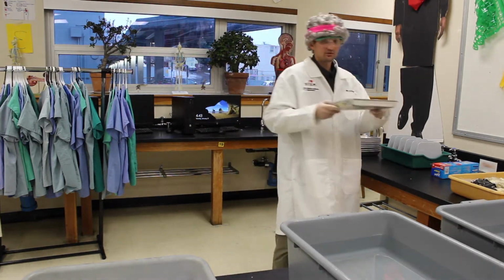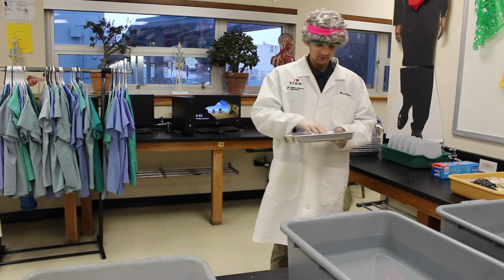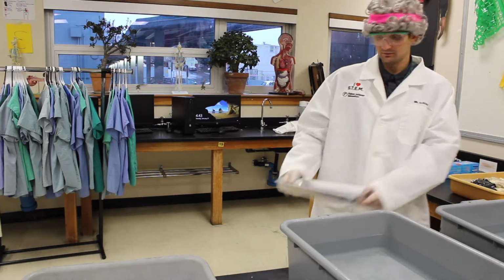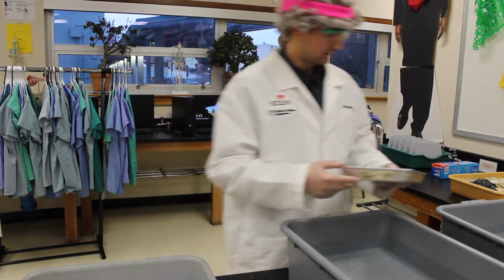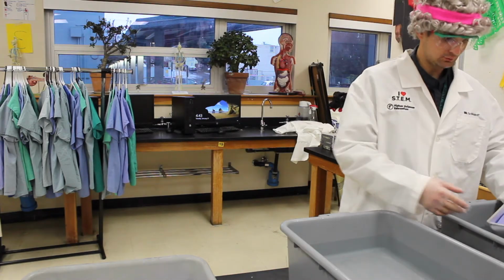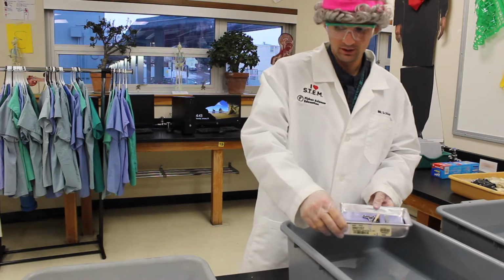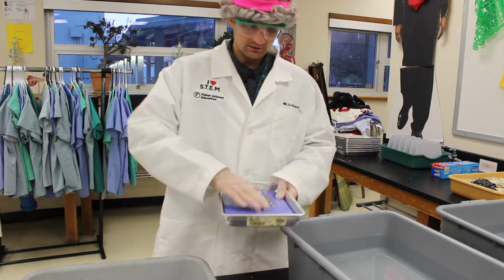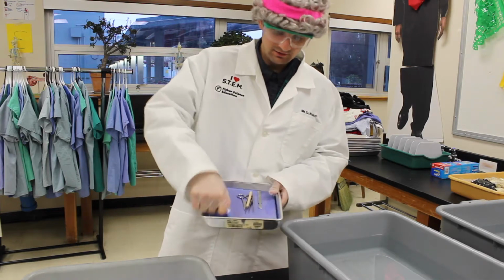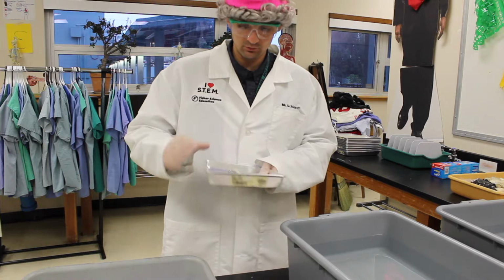So, once you have disposed of your material in the green bucket down below, you're going to take your supplies through a couple areas. So first, you're going to rinse it through the bleach water. Then you're going to rinse it through the regular water. Make sure you get off all the junk. Clean off these. These sticky parts come off, so please make sure you get all the bits and pieces away.